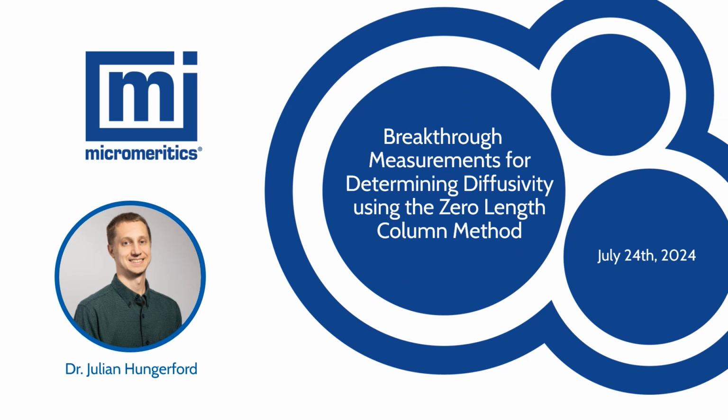Today I'm going to be presenting breakthrough measurements for determining diffusivity using the zero-length column method.